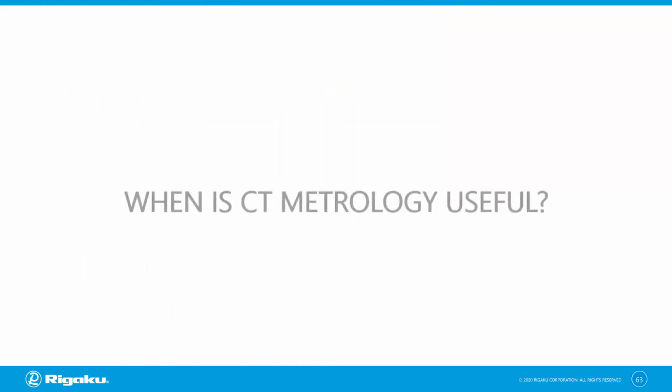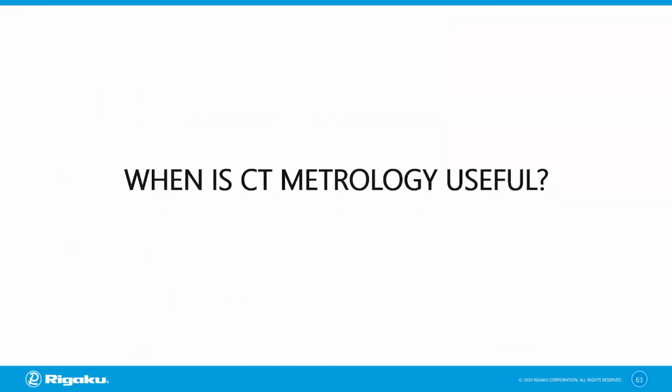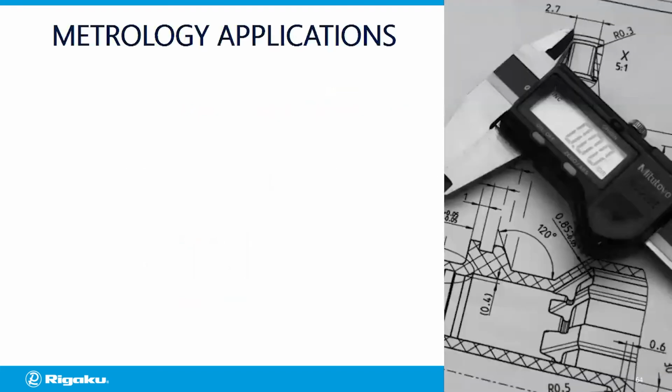Okay. So when is this technique useful? There are many areas you can use X-ray CT in, and one of them is just simple dimensional measurements.